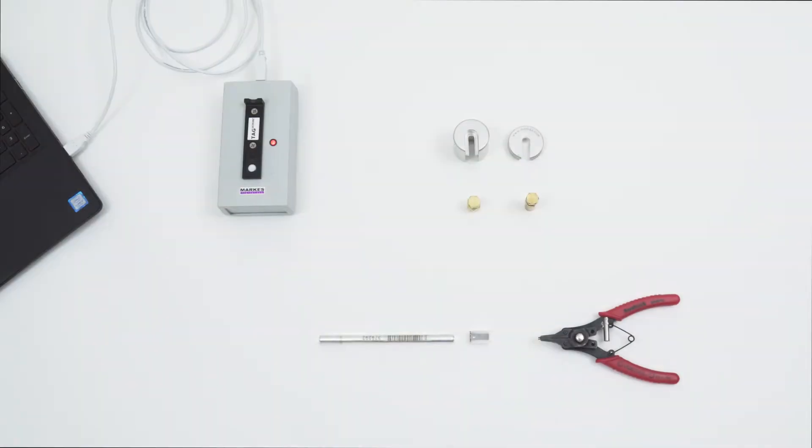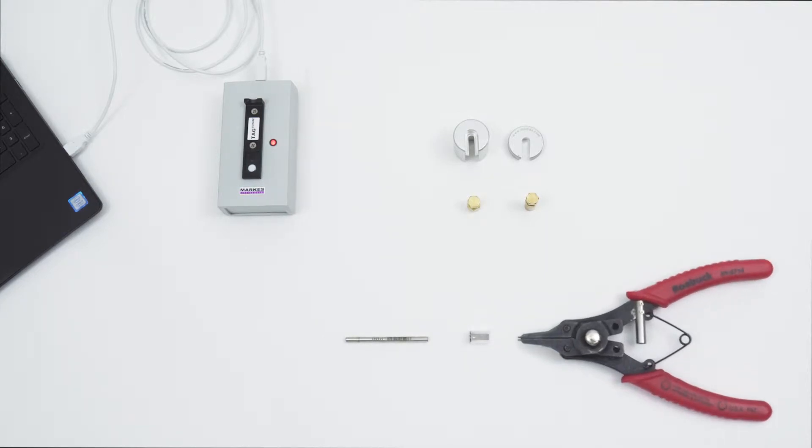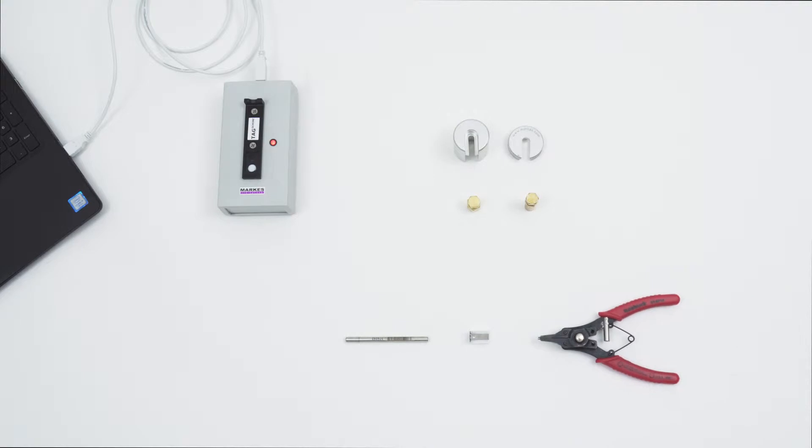You will need a stainless steel tube, a TubeTag, a TubeTag fixing removal tool, a pair of TubeTag compatible storage caps, a TagLock tool and a TagScribe connected to a Windows compatible device or an automated Markes thermal desorption system loaded with the MIC software.